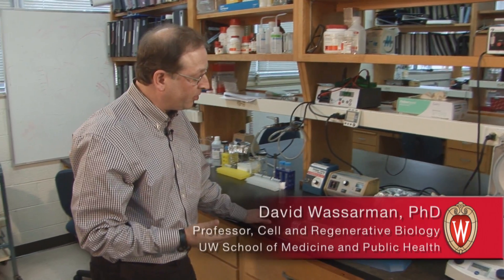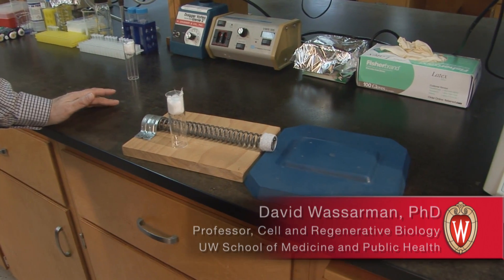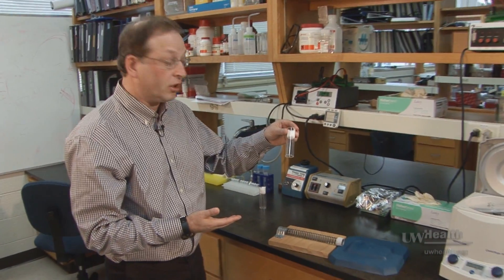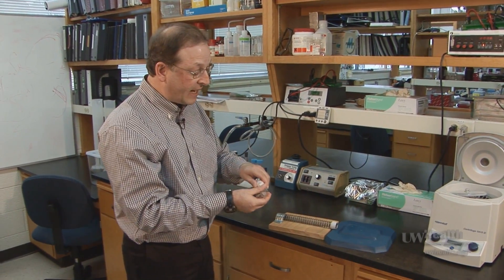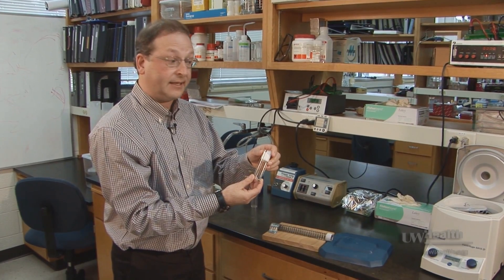This is an instrument that I built based upon Barry Ganetsky's original observation. When he took flies in a container like this and opened his hand, hitting the flies hard with a rapid motion, he found that some fraction of them became incapacitated.